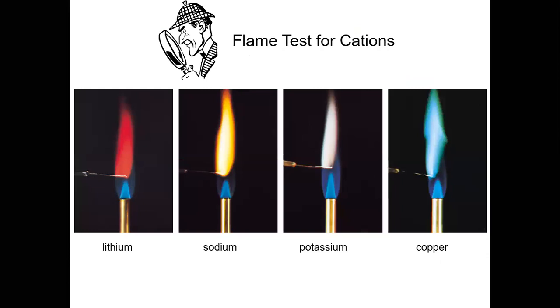Here you can see the image of the flame of the Bunsen burner. This was the non-luminous flame earlier, but when some salt or compound containing lithium is added, it shows a very red color, crimson red color. Sodium will produce some yellow color. Potassium should be purple, lavender, or violet.